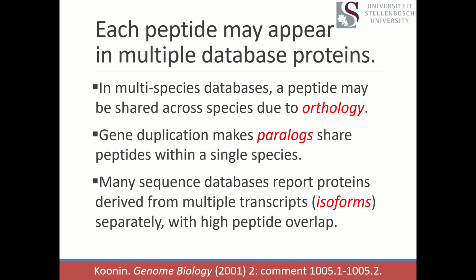Paralogy is a separate kind of problem, because over the evolutionary history of species, we have lots of cases, especially in things like trees, trees are murder, where gene duplication has been taking place in a lot of cases.